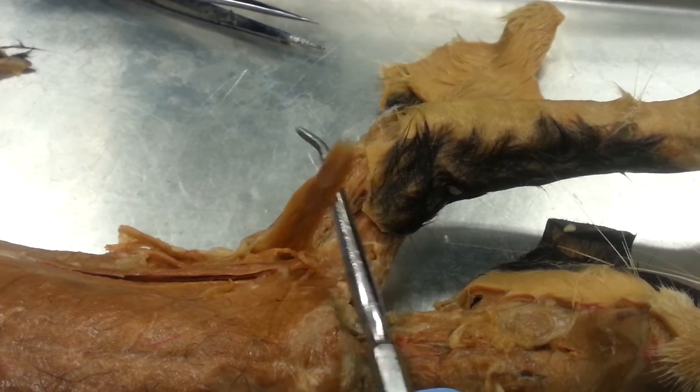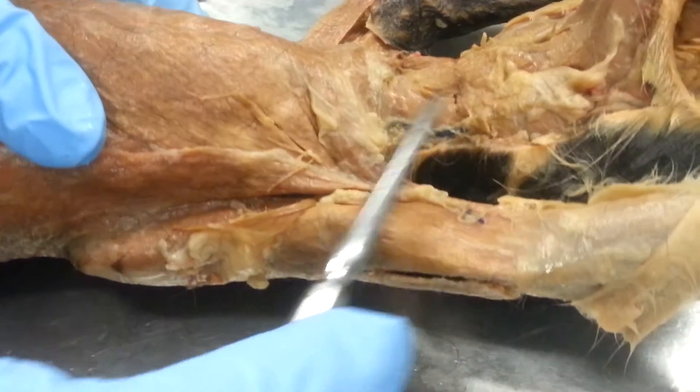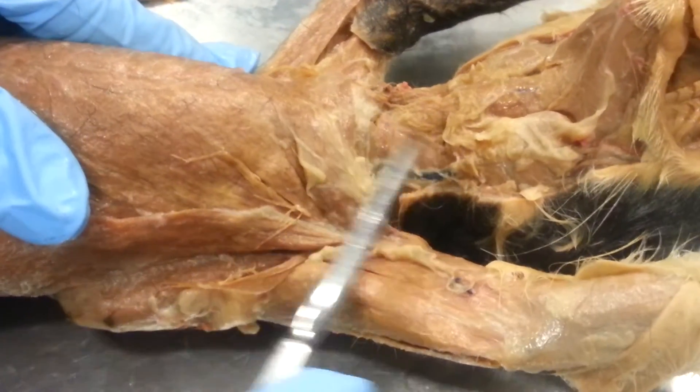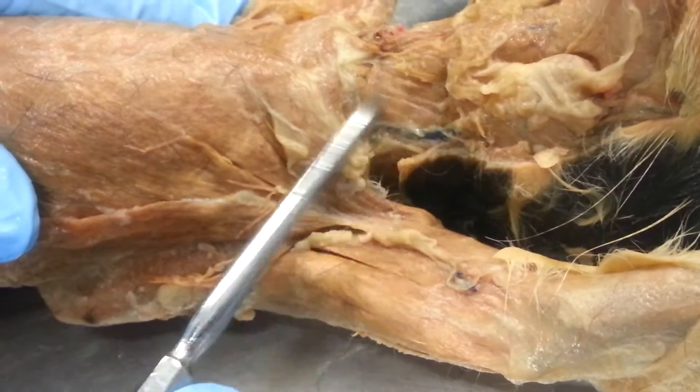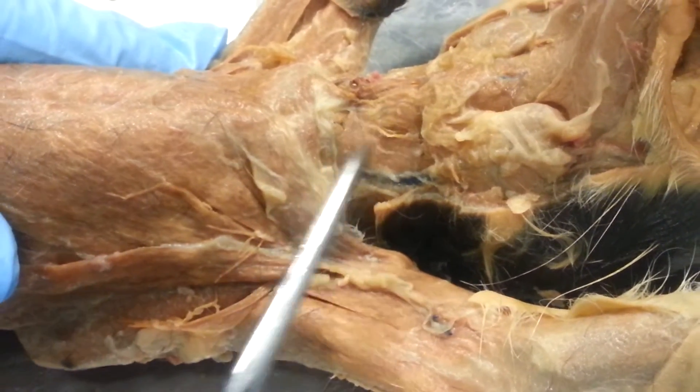This is the epitrochlearis. And then right here — let me see what I'm doing, it's kind of hard to see — but this muscle right here is the sternomastoid. Right here, you know.